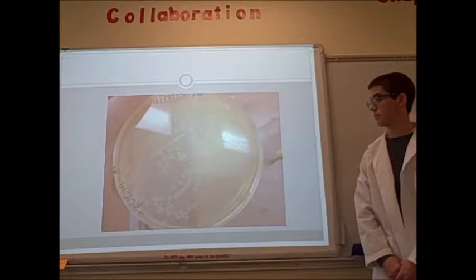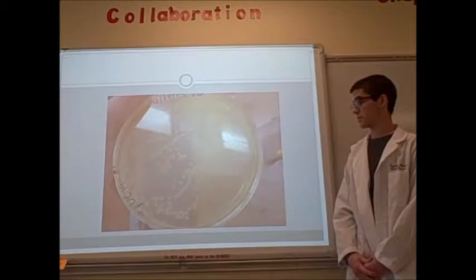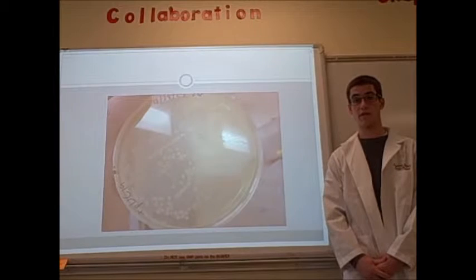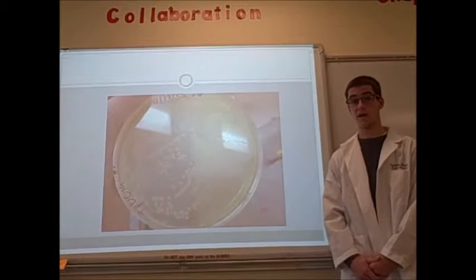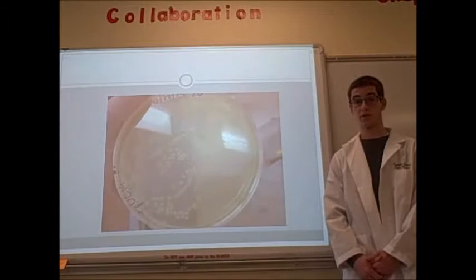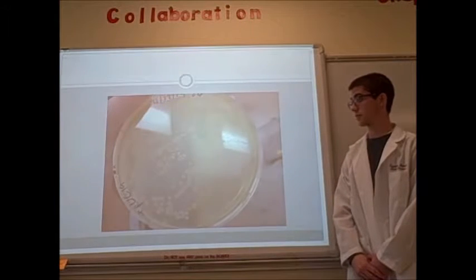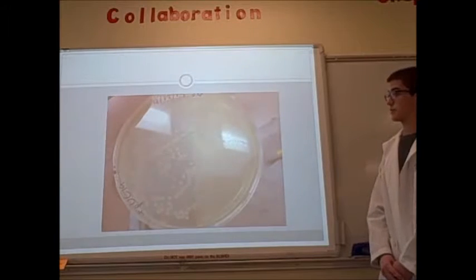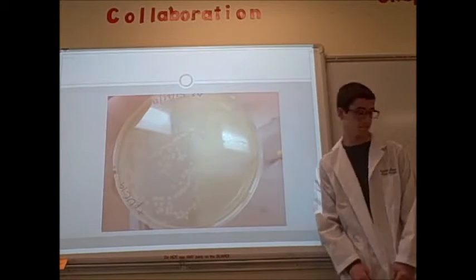Here is my positive pUC19 plate on a tetracycline resistance plate. This is a very important plate because for the bacteria to be infected with the phage, they needed to have an F prime fertility factor. This fertility factor was selected for by plating my E. coli on tetracycline plates. The tetracycline resistance and the fertility factor were located in the same plasmid, meaning that any bacteria grown on the tetracycline plates was viable for phage infection. This plate shows that my bacteria used in the pUC19 transformation were equally similar to my bacteria used in the M13 transformation.